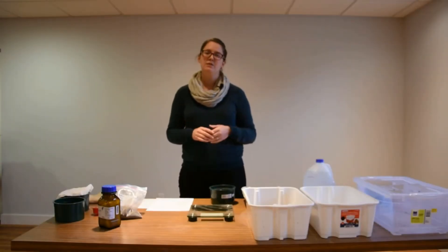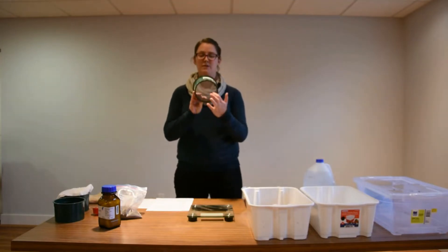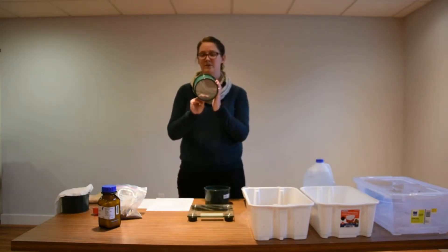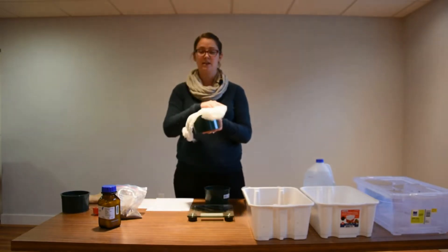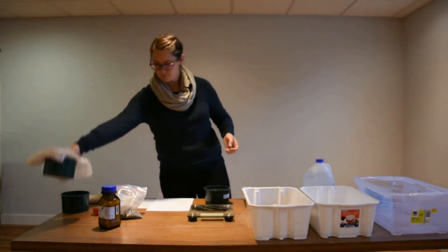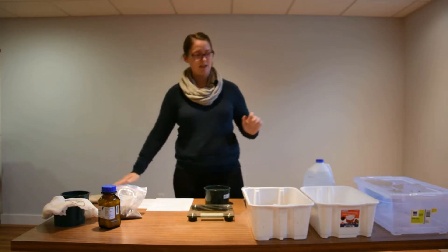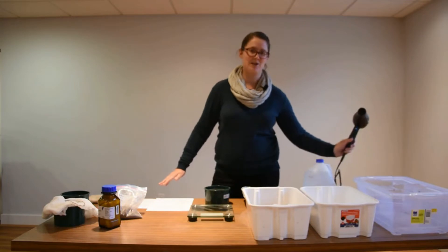The materials you'll need to do the soil aggregate stability test include your two millimeter sieve — this has the bigger holes along the bottom. You'll also need a few of your 0.25 millimeter sieves, which are a little bit finer. Along with this, you'll need a terry cloth to cover it and an elastic band to hold it in place. You will also need a few terry cloths to help wet your samples, as you'll see shortly.